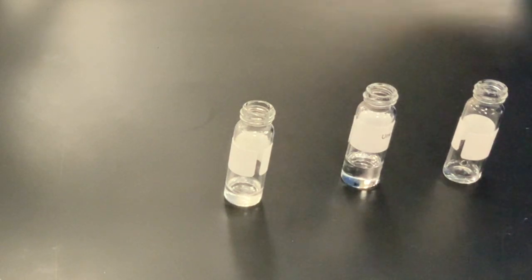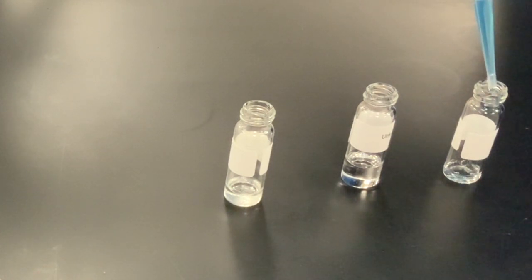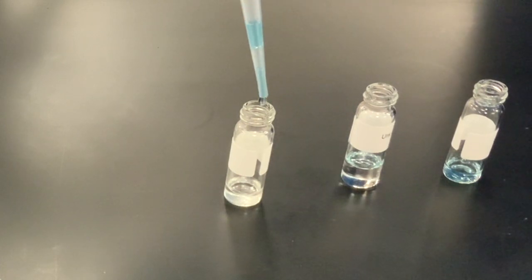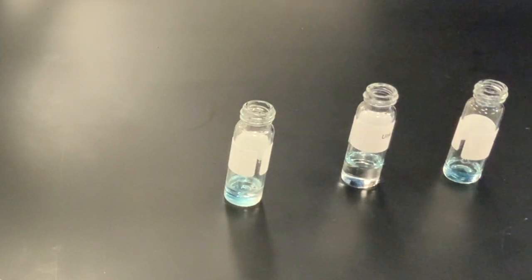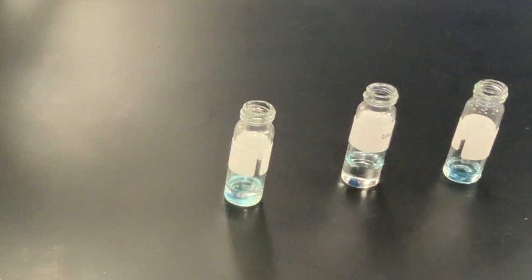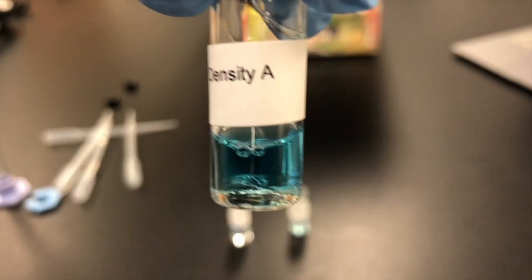So we're going to take a few drops of water into A, a few drops of water into B, and a few drops of water into C. Here we're going to see the miscibility of the water into the three liquids.